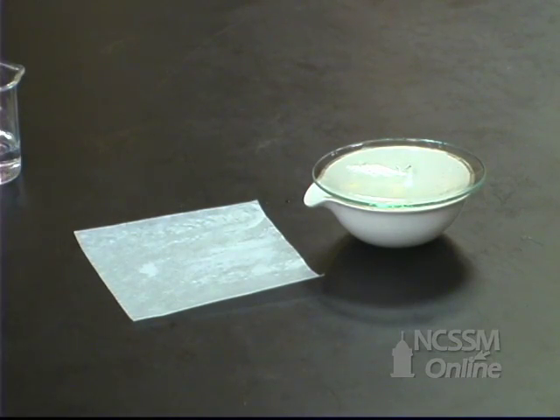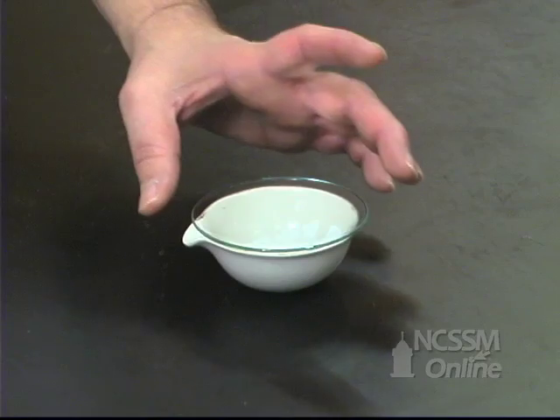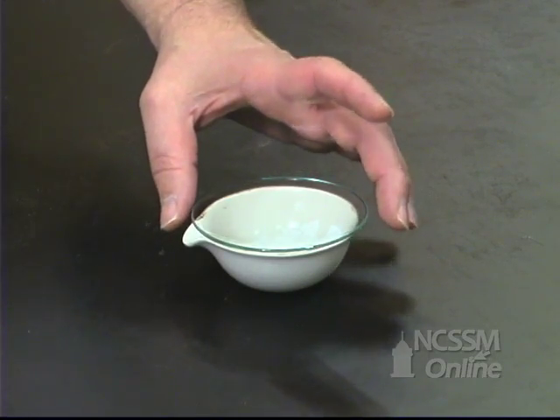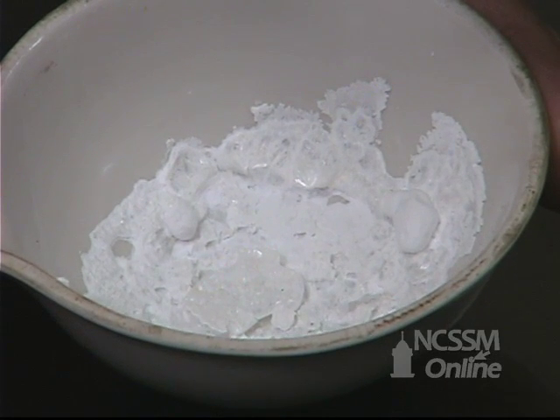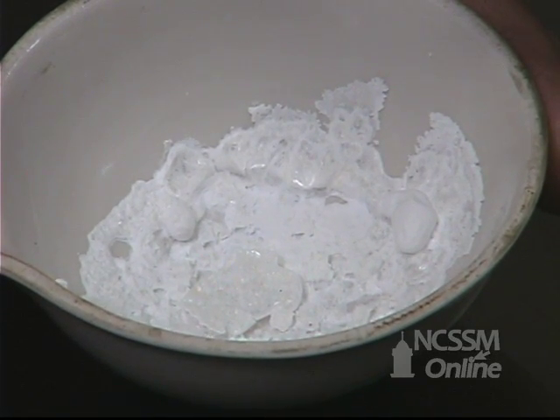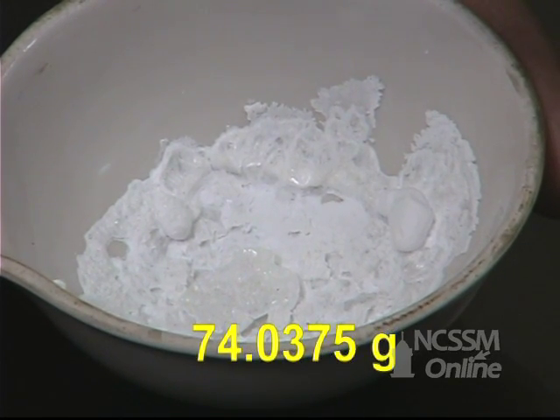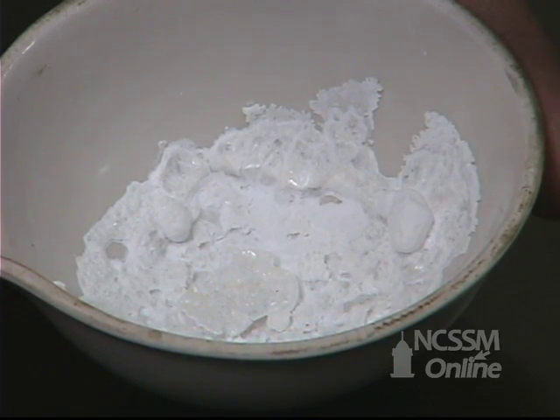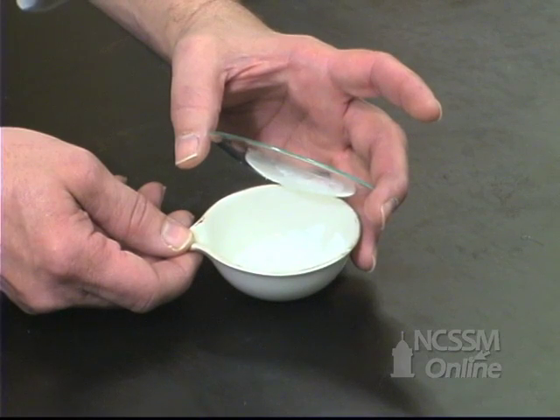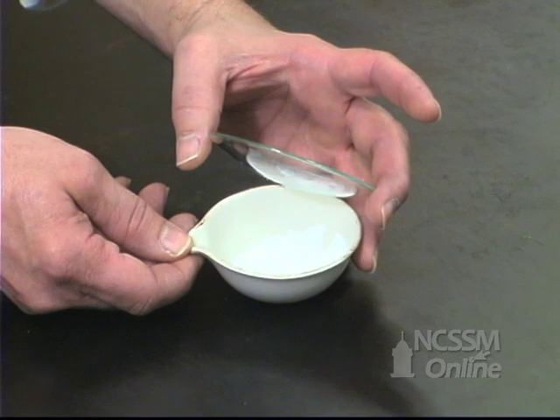We'll then evaporate the mixture to dryness. We've heated the sample to evaporate all the water and the excess HCl. What we're left with is the sodium chloride. We mass the evaporating dish and watch glass, and this allows us to calculate the mass of sodium chloride produced. We use that mass to back-calculate how much sodium hydrogen carbonate and how much sodium carbonate were in the original sample.